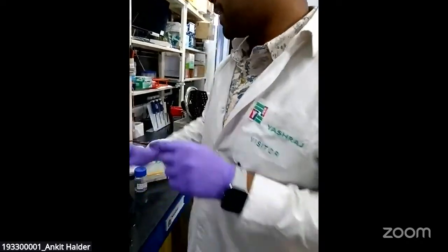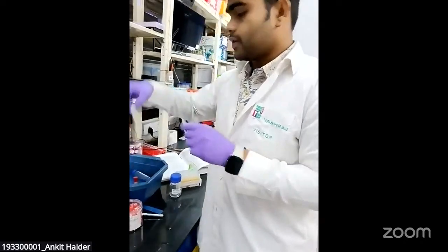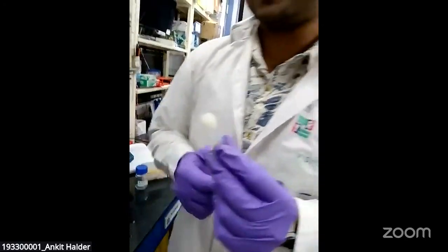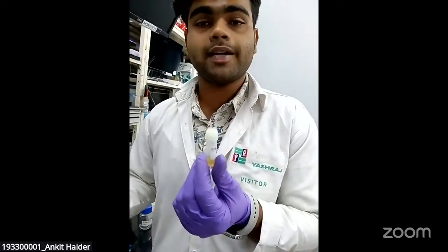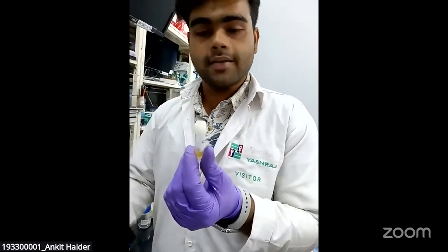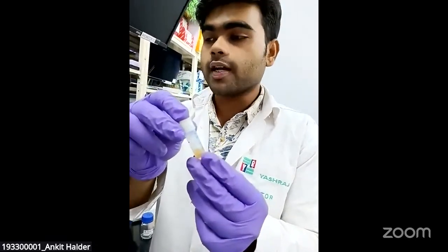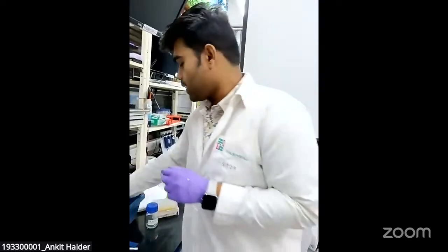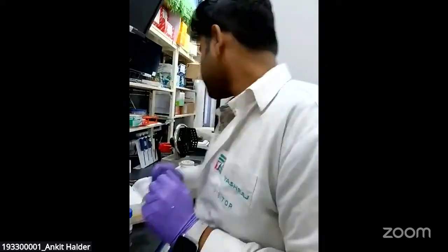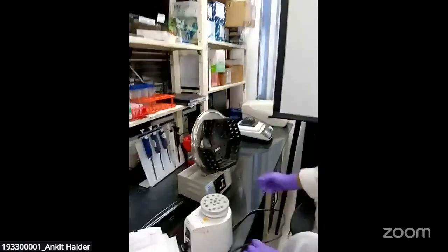Similarly, for lipidomics, I will also explain the lipid protocol. So we can isolate metabolites and lipids from the same kind of sample. For the lipidomics, we take 50 microliter of sample. We add chloroform and methanol in a 2:1 ratio. After that, we need to mix it in an orbital shaker.